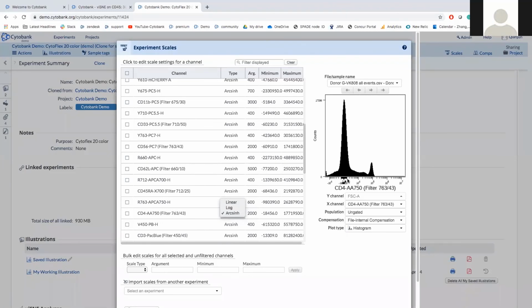So when you have a linear range around the zero here, what you're expecting for a good argument or good transformation is where you have a nice peak around the zero region. Whenever you see something that you have a dip around the zero, that's not correct.